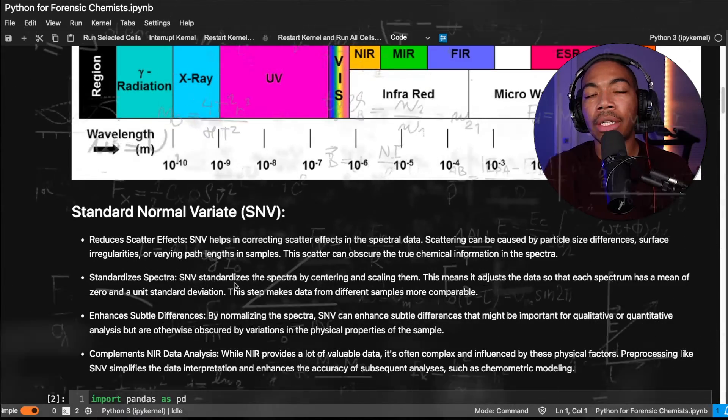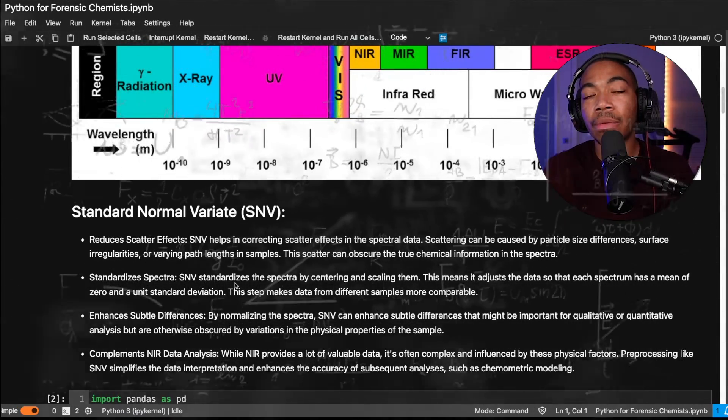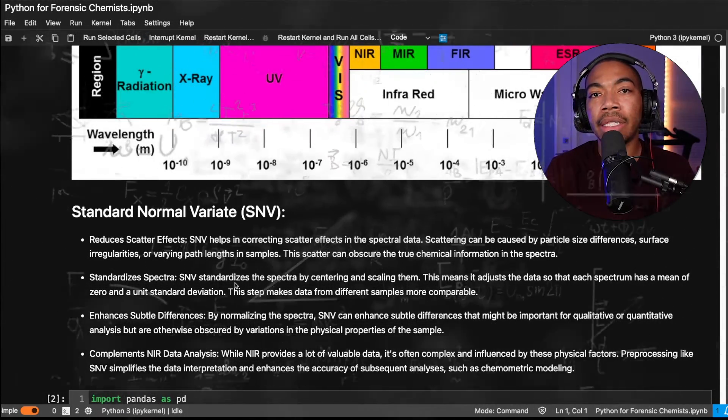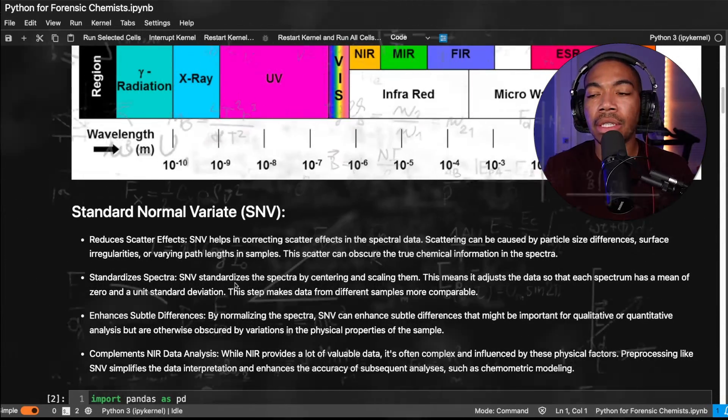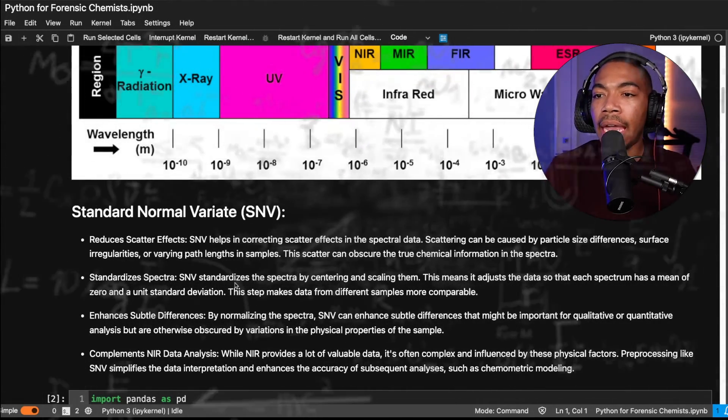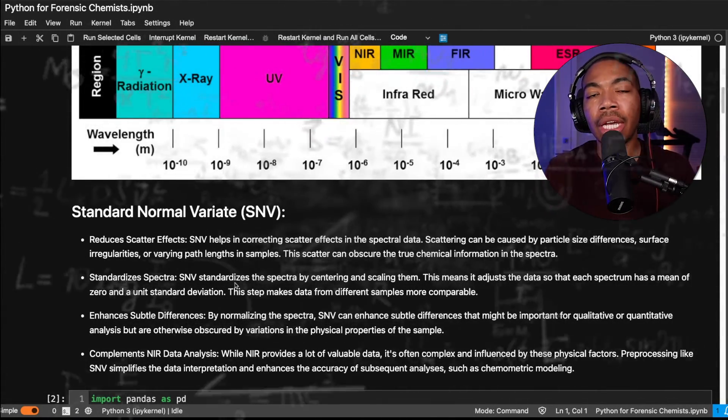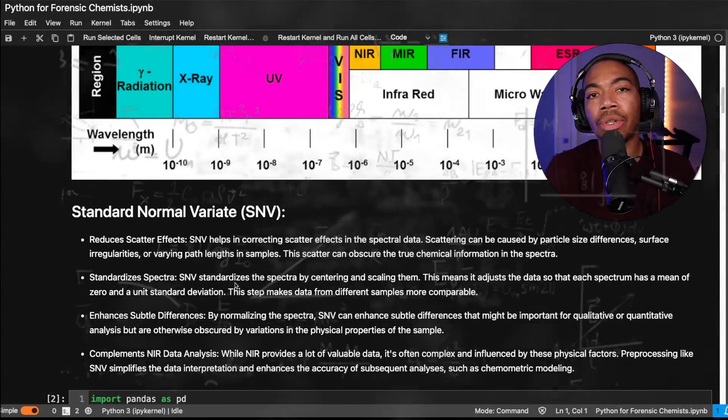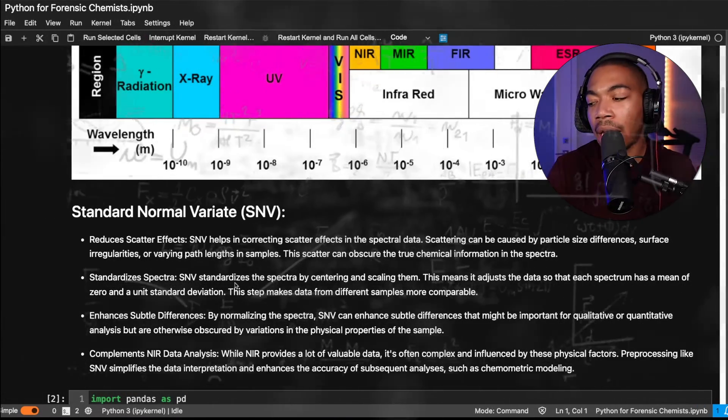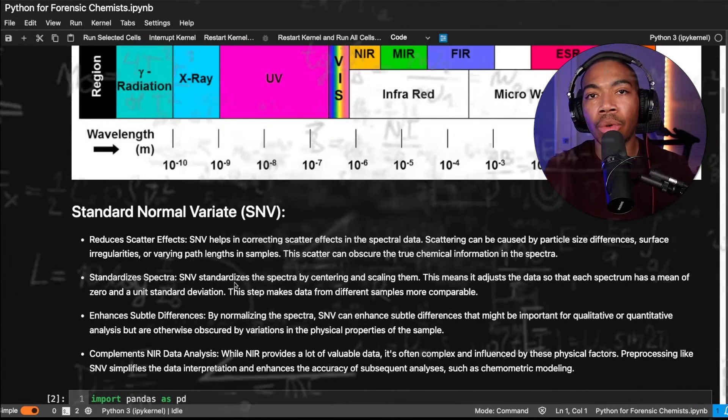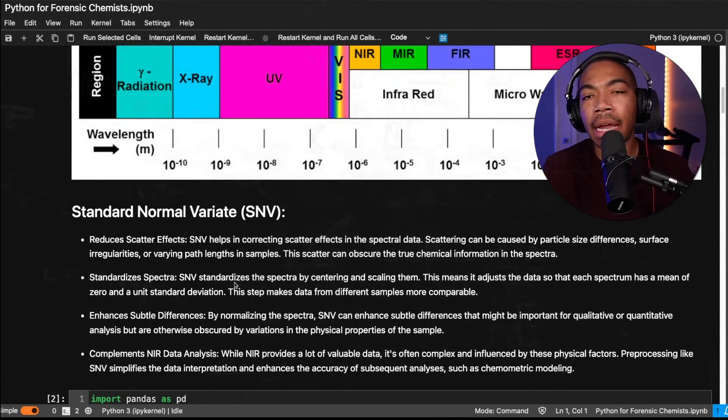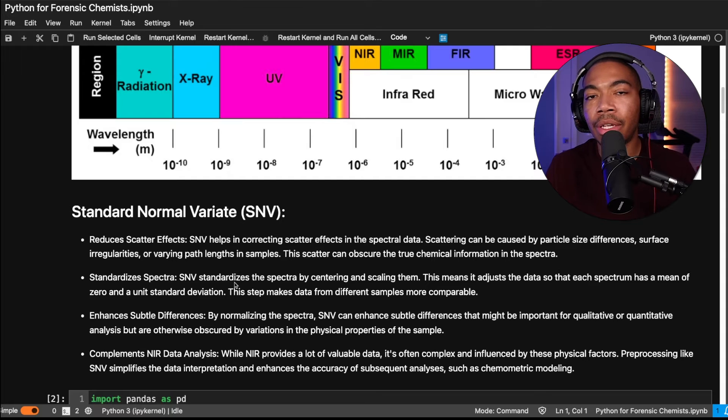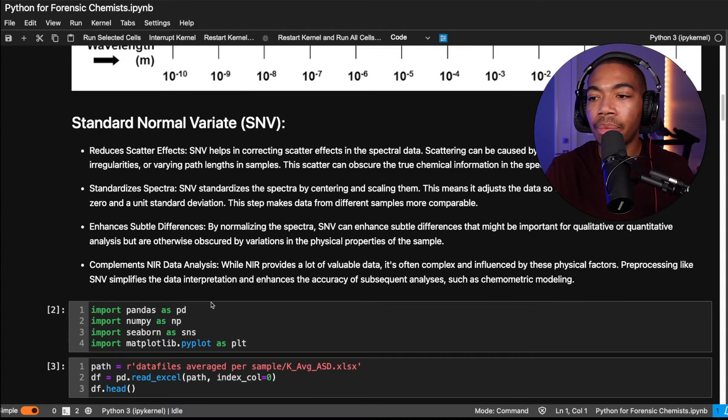The fact of what we're going to be doing for this data is z-scaling each spectrum. That is, we're going to compute the mean, we're going to subtract all the data points in that spectrum from the mean, and then divide by the standard deviation. So we have a univariate signal, and that will highlight some of the smaller changes and help us to control for this scatter, which will appear somewhat as systematic error that would be addressed using this SNV processing.